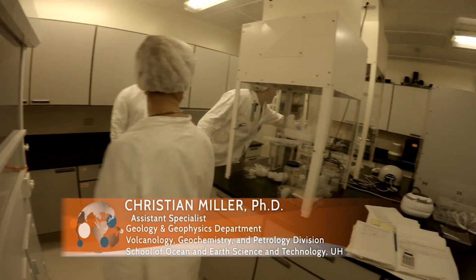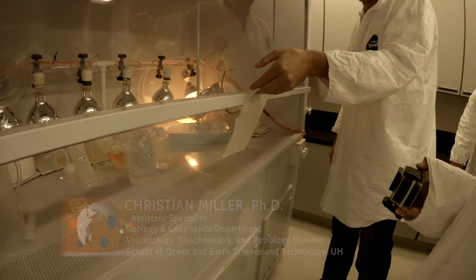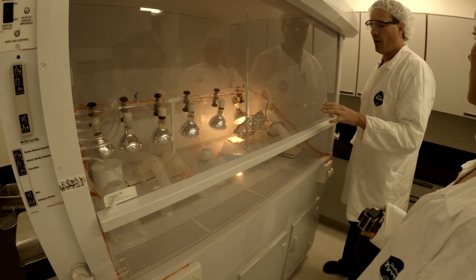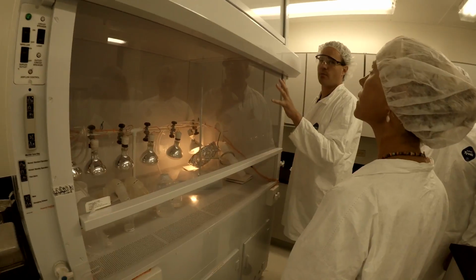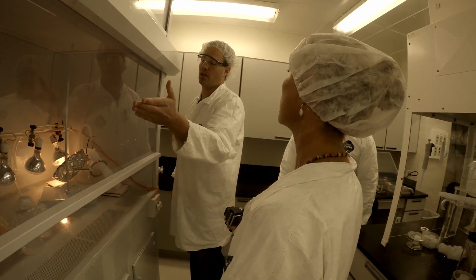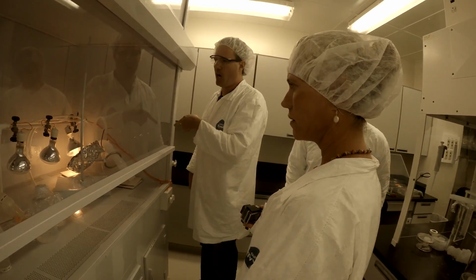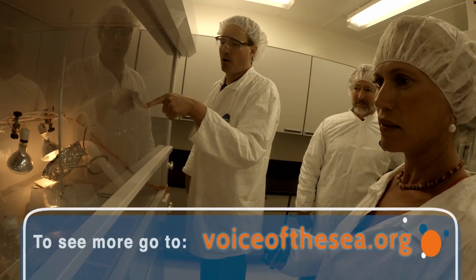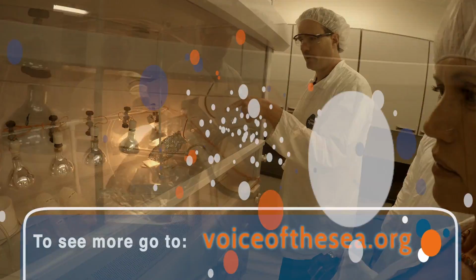You can see there's a very gentle draw of air into the hood, so we try and work with our acids in hoods that exhaust, whereas we can do other kinds of work in that hood over there, for example, which does not exhaust. But again, also a clean hood. In this one at the moment, I'm distilling hydrofluoric acid in an elbow still. Right there are 2 hydrobromic acid stills, the orange liquid.